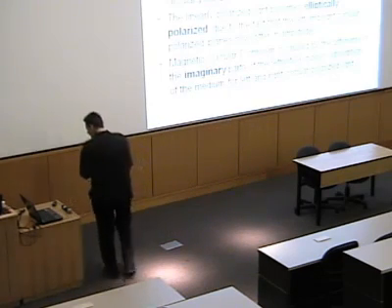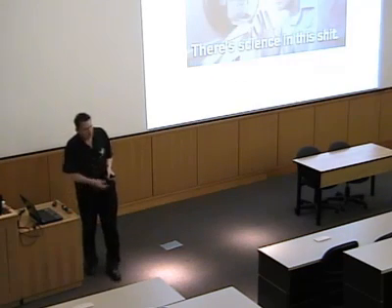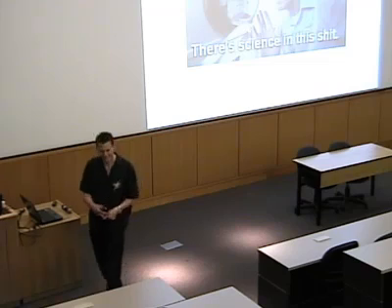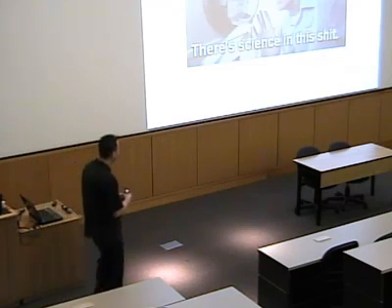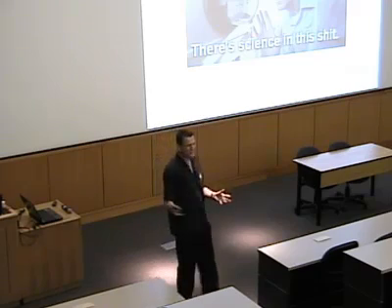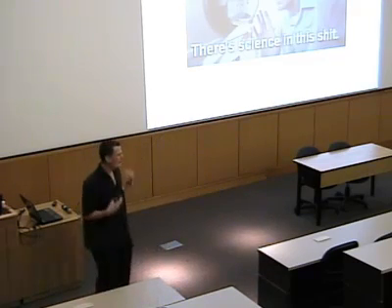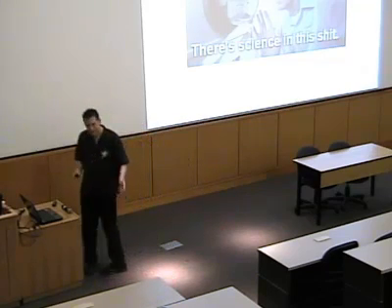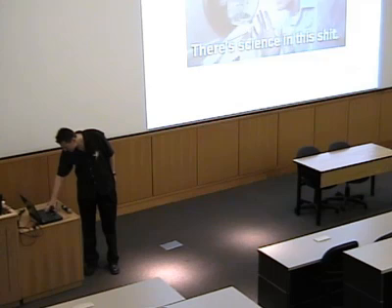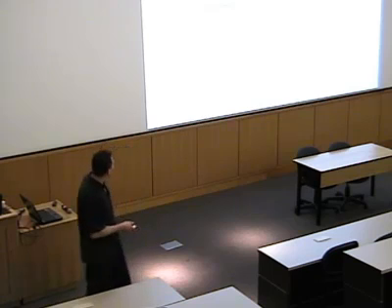So now you might say, well, that's all nice and pretty interesting, right? But can we actually do anything with this? In our daily life, is this going to help us solve some problem in the lab for some metalloprotein? And hopefully I can show you that, yes, we can make use of this more than just in this kind of interesting physical effect that Michael Faraday discovered. And so here's just a little bit of the fundamentals, what we do in an MCD experiment.